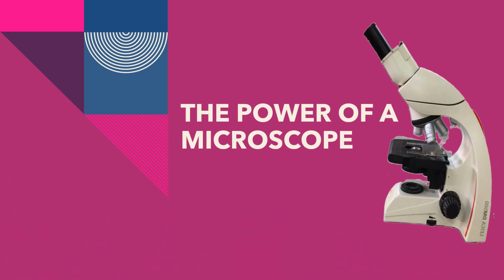So how powerful is the compound light microscope? I will say that it is powerful enough to make invisible objects visible to the human eye. It is able to enlarge minute micromolecules enough for us to see with our naked eyes. That is how powerful the compound microscope is.